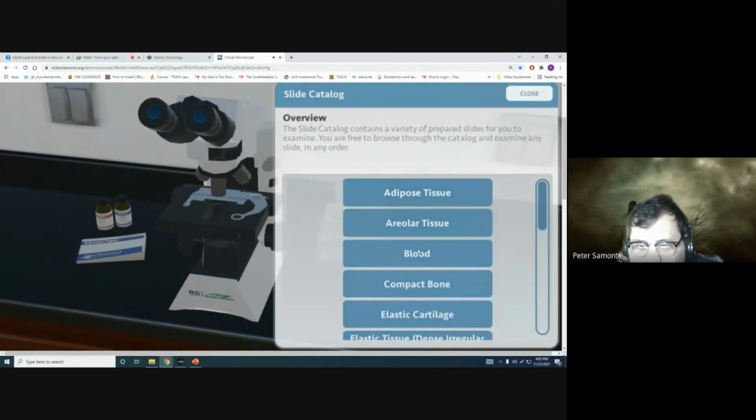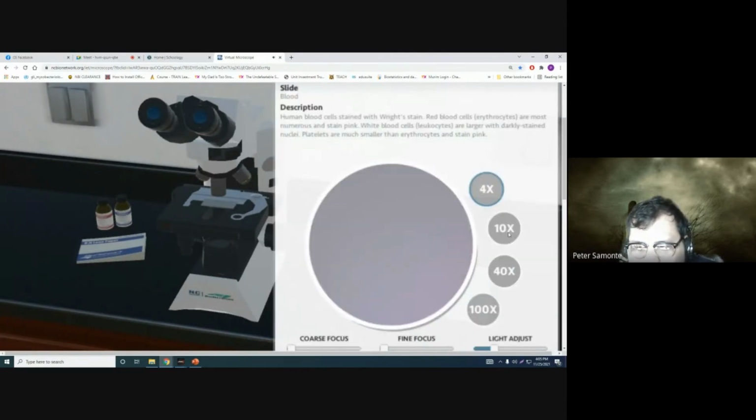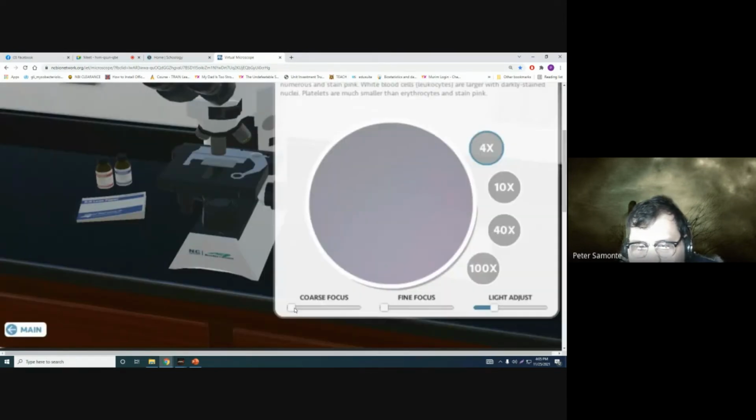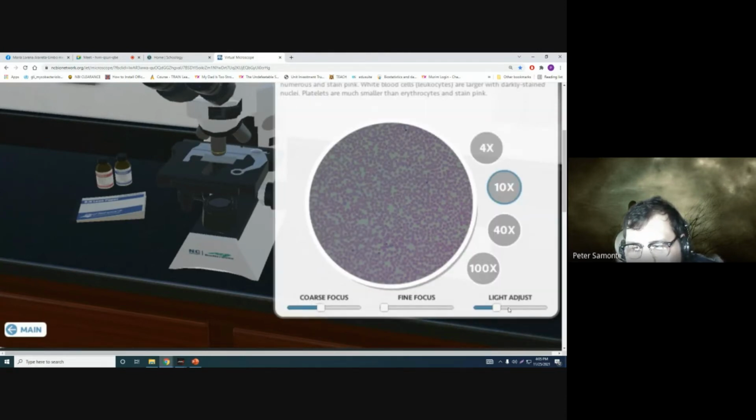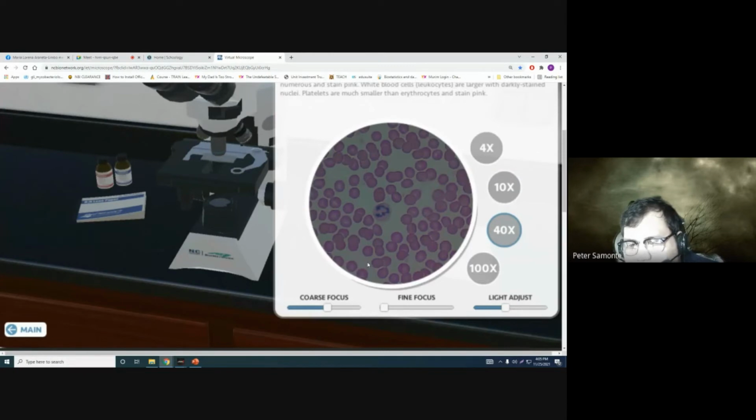Okay, back to human, to blood. So, scanner. Adjust the light. Transfer to your LPO. Adjust the light again. Then you now move to your HPO. Now, in your HPO, class, it would usually start dark. Then you have to adjust your fine adjustment until what you see becomes a bit finer.